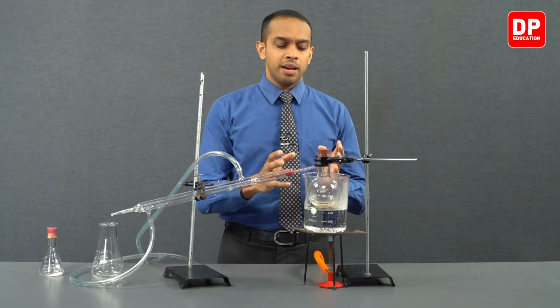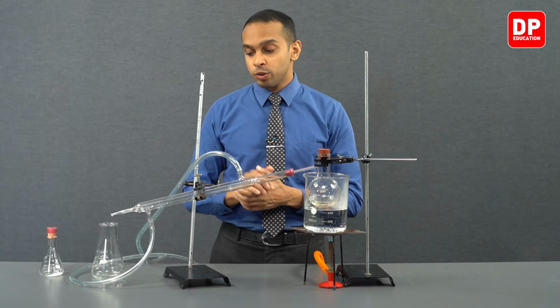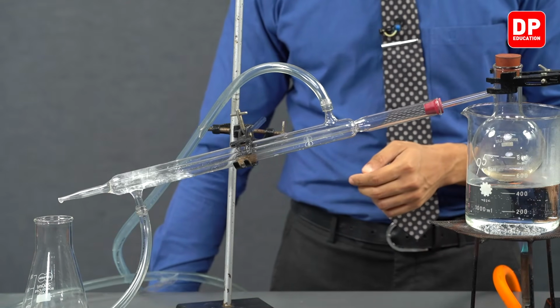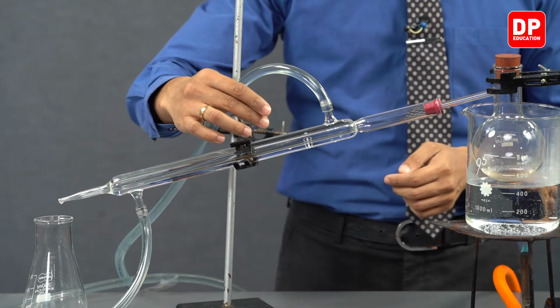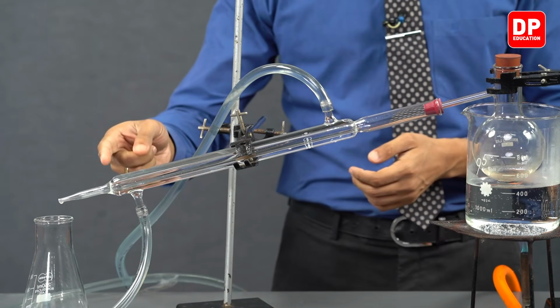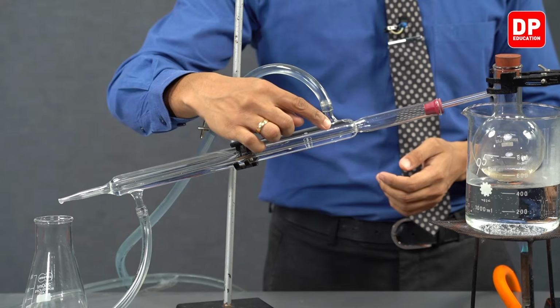Now students, as the system is starting to produce steam, we will turn on our tap to fill this Liebig condenser. So let's go ahead and turn the tap on. You can see that this particular Liebig condenser is completely filled now. What is entering the Liebig condenser from this end and is traveling all the way up to this end.